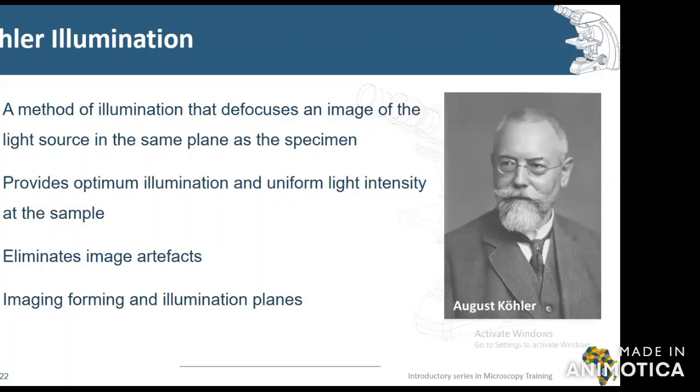Today, the Köhler illumination procedure is very essential when talking about the principle upon which most light microscopes are built, and even some other advanced microscopes, which include the confocal microscope, the DIC, and even the phase contrast microscope. So the Köhler illumination form of sample illumination is very key.